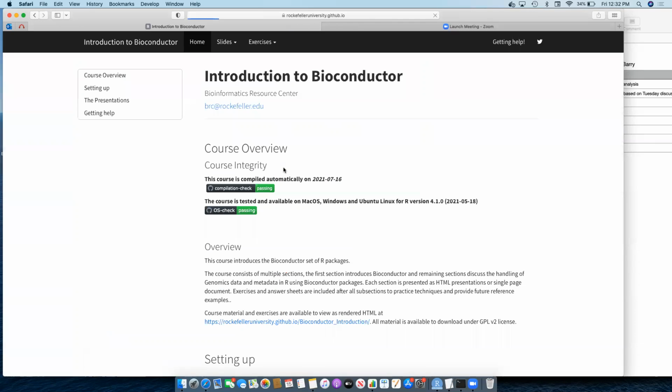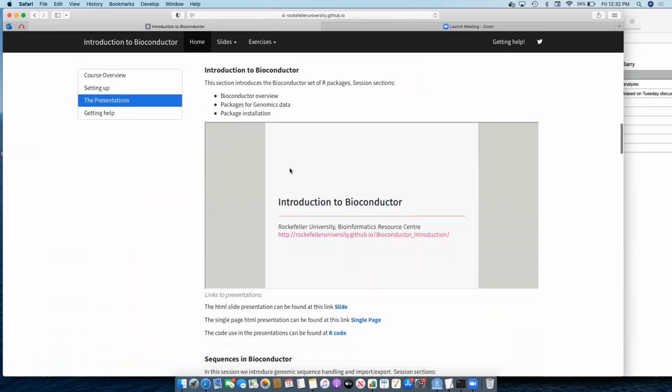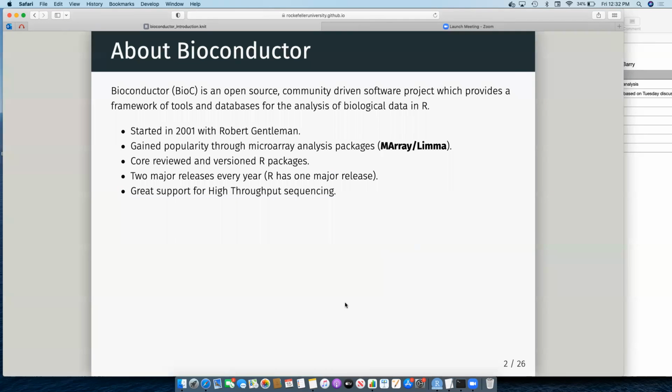Right. So the next thing we're going to cover is Bioconductor. Bioconductor is a set of packages organized by this collaboration, I guess we'll say. It really is essential for the work we do. They have built, mostly based around expression arrays, a whole ecosystem of libraries which are interoperable and very easy to follow. So let's have a little talk through these first few slides. I'm just going to introduce us to Bioconductor, and then I've got one other session I want to run in this first part.